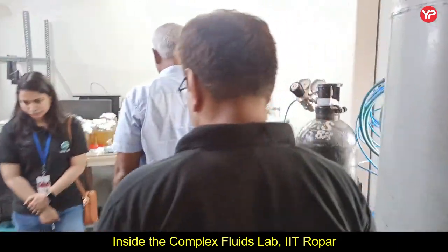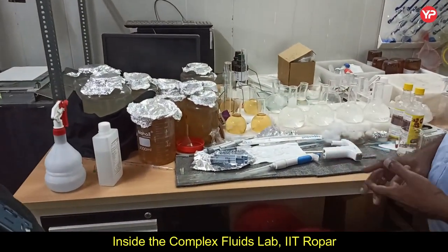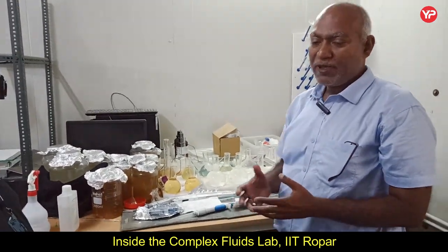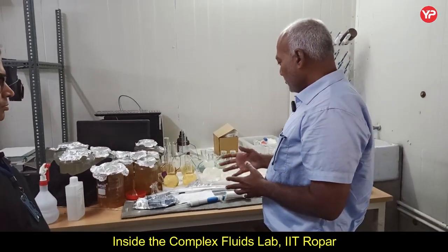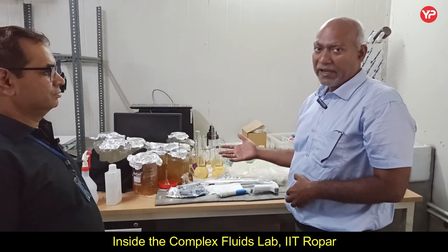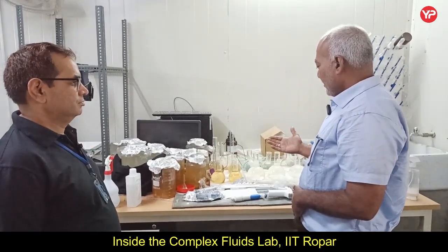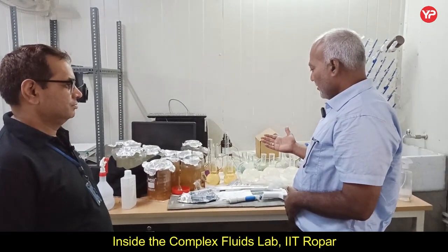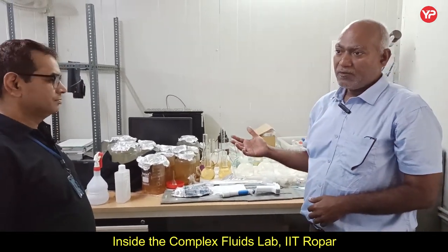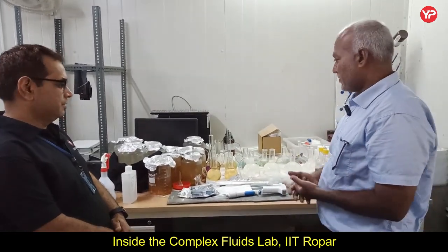In this area we grow small microorganisms, suspensions of microorganisms. One is vinegar eel, another is paramecia. These are self-propelled or swimming microorganisms, as we say. And then we do the rheology and other experiments of active systems. These are active because they can swim on their own, and they can show very interesting patterns and behavior which passive particle systems do not show. We are trying to understand why that is, the basic physics of it.